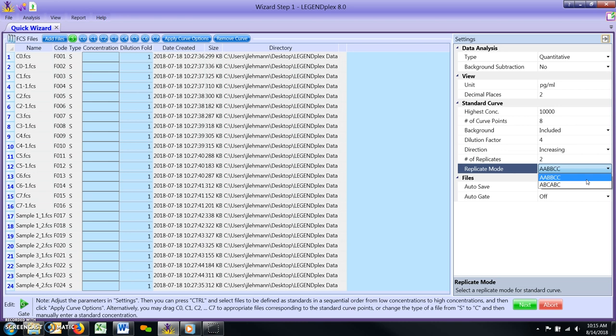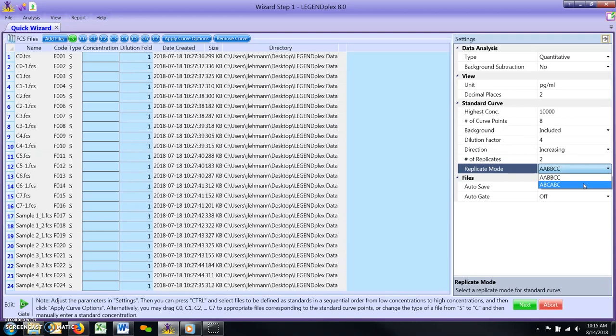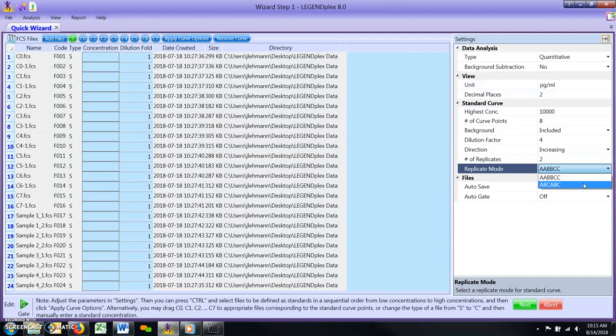The ABC, ABC mode is used if the standard curve files are listed by the entire dilution series followed by the replicates series, i.e. C7-C0 files in the first replicate, then C7-C0 files for the second replicate.